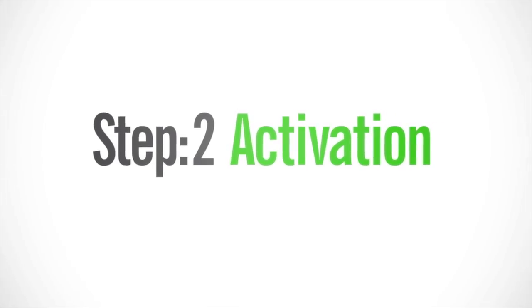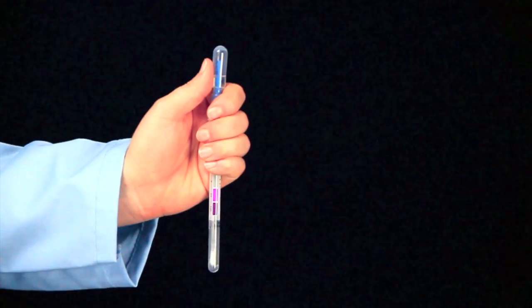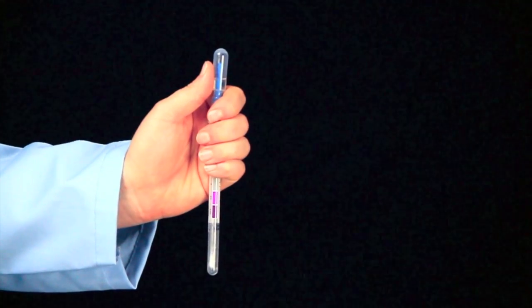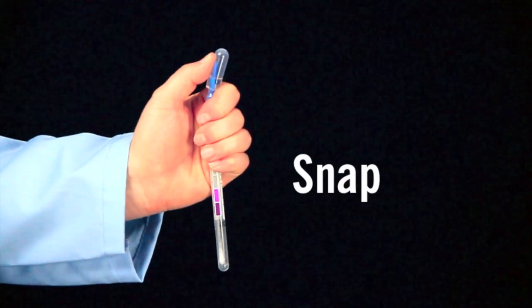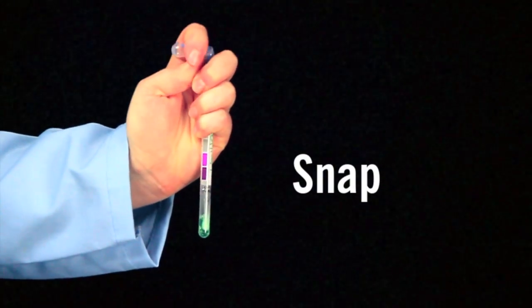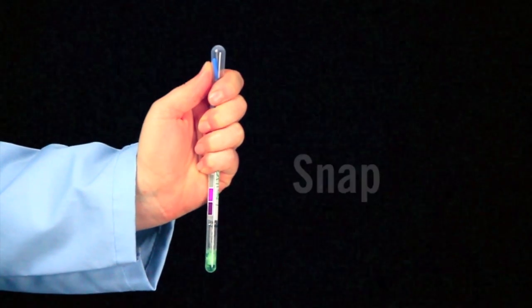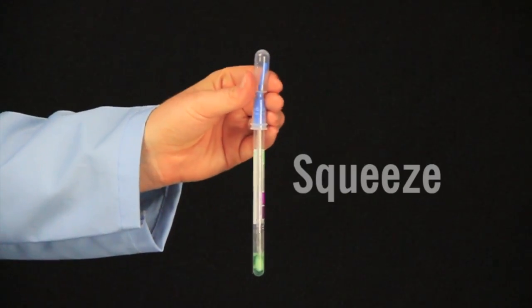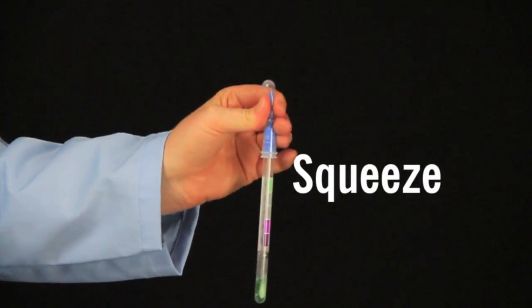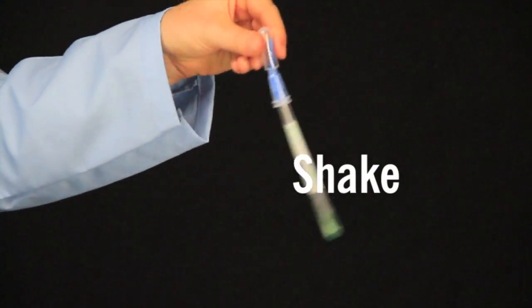The second step is activation. The easiest way to activate Allersnap is to hold the device in your fist and use the thumb and forefinger to break the snap valve by bending the bulb forward and backward. Next, squeeze the bulb to expel liquid into the tube. Then shake for 5 seconds.